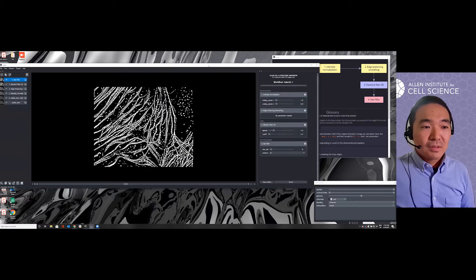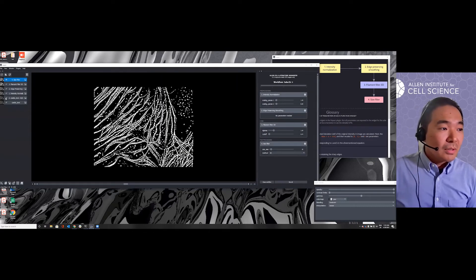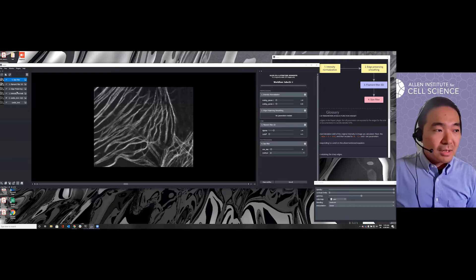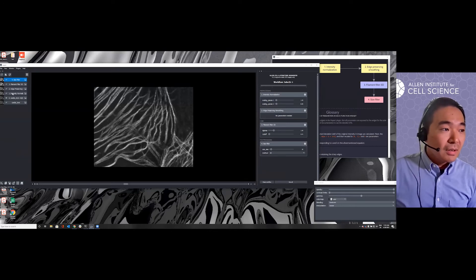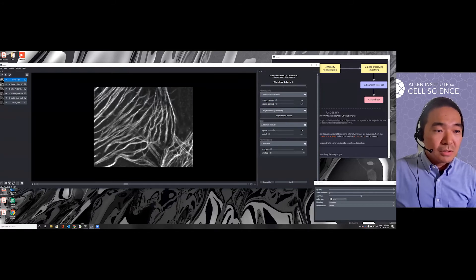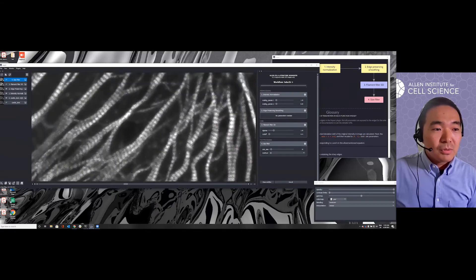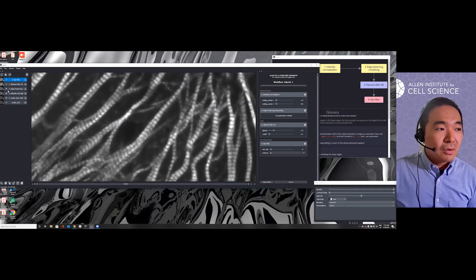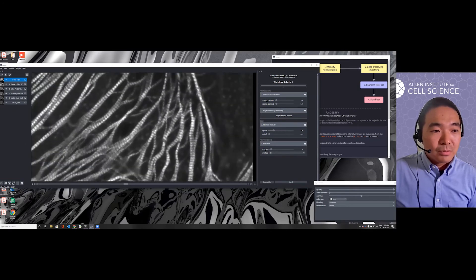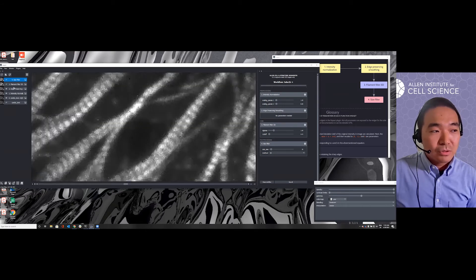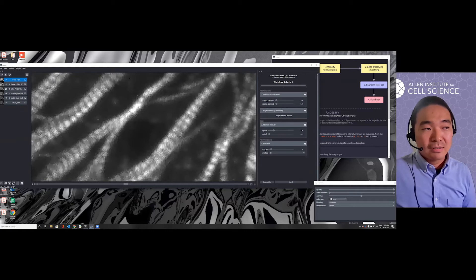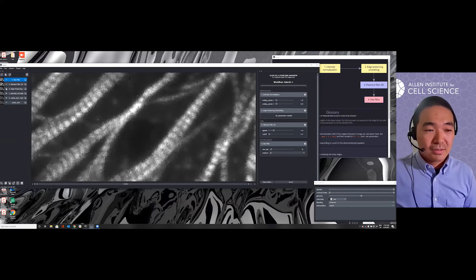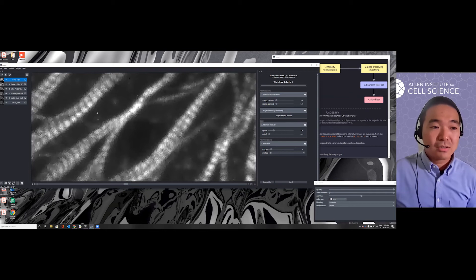Okay, the segmentation comes out and we can see all the intermediate results are saved here. First, we have the intensity normalization and then the smoothing. Let me zoom in a little bit. By toggling on and off, you can appreciate that this smoothing really reduces the noise in the background without hurting the actual high frequency signal along your structure boundary.